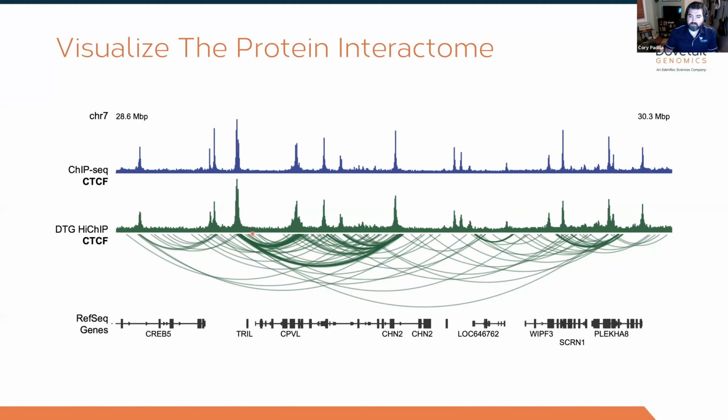So it really allows us to not only see where those potential chromatin boundaries are, but now we can say, okay, these two are really interacting with each other, and so are these two. So this is likely going to be a TAD. Here's going to be an internal loop within that TAD, things like that.